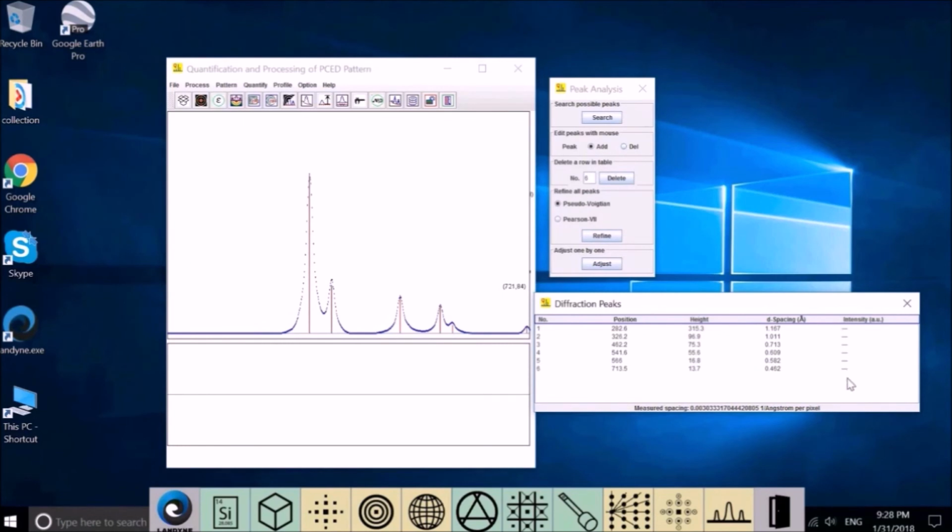The intensity is still not defined. Here we have a right click of the mouse. We can show the peaks as bars or overlap superposed. And you can see it defined the peaks perfectly. And this one you see is a little lower because they are superposed. And this one also lower. The last one is to show the overall composite. It will trace the experimental data perfectly. So normally we just show the second one, overlap superposed.